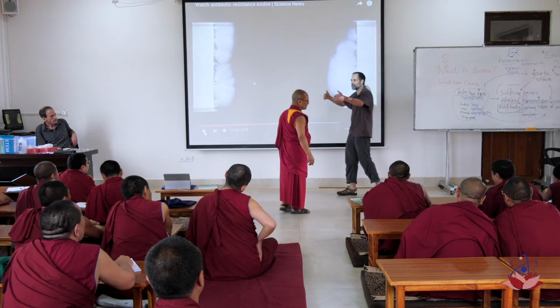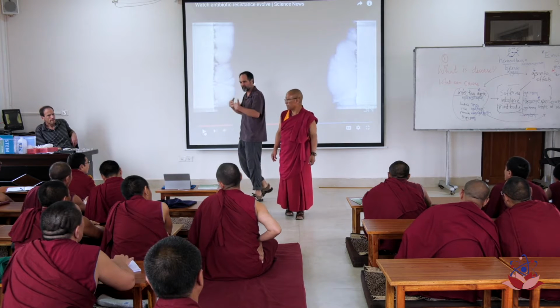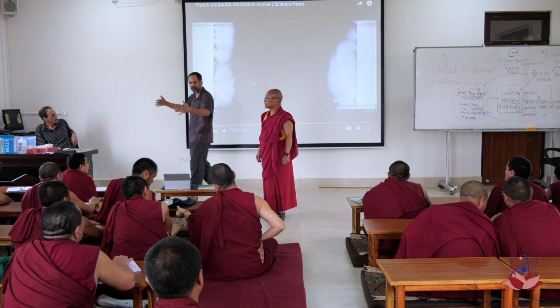It's like a wave of bacteria. Much like the colonies on this plate. You can see the colonies are moving across that plate.